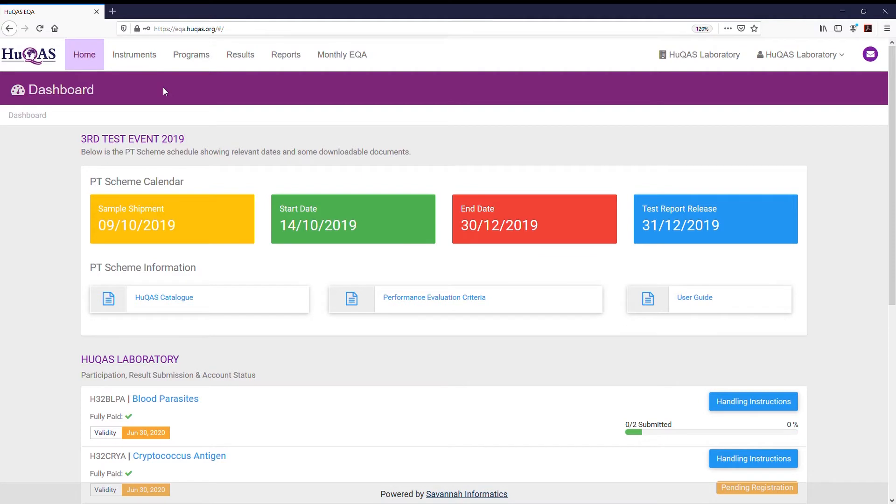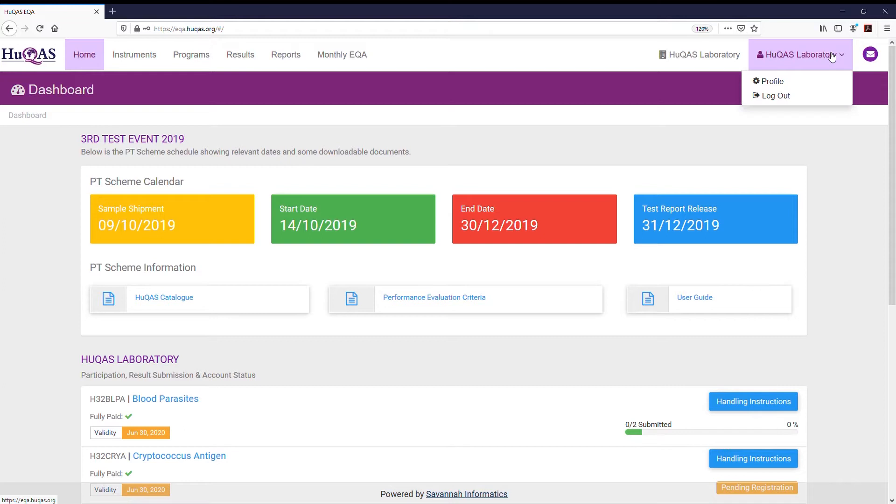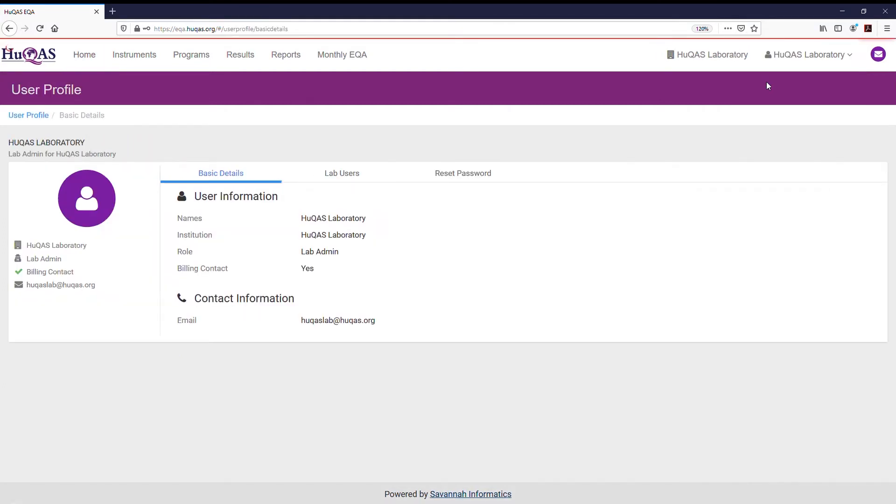Click your name on the drop down menu on the top right of the navigation bar to reveal the extra options. Click on profile to access the user's page.